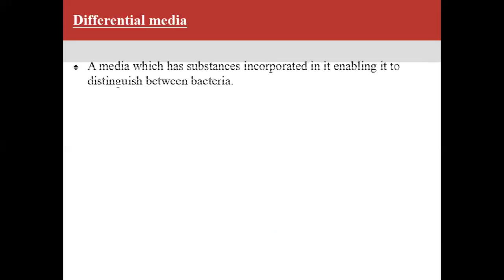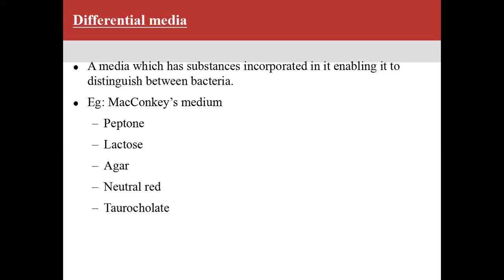So next, differential media. Differential media has substances incorporated in it which help to distinguish between the different characteristics of bacteria.